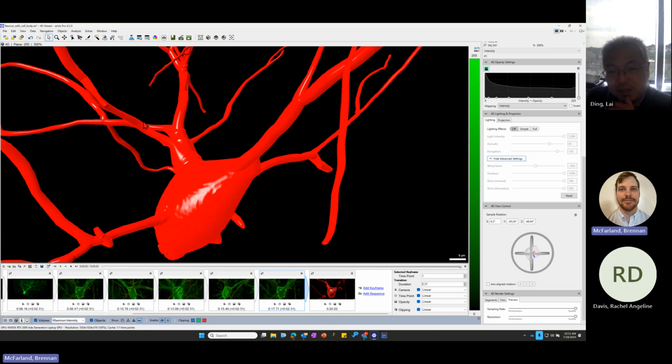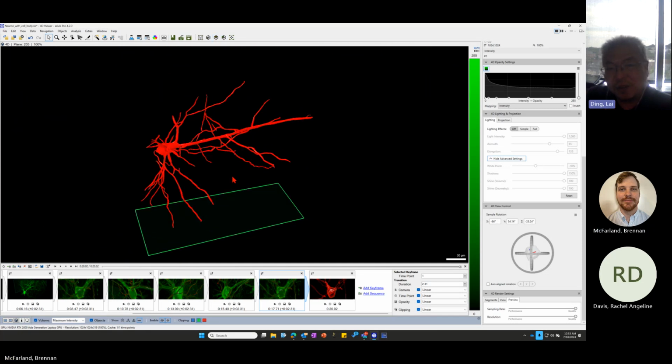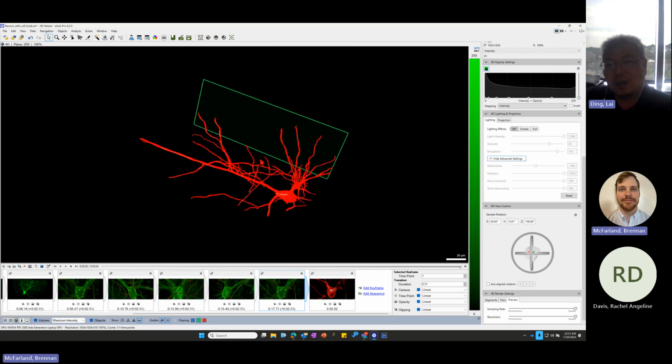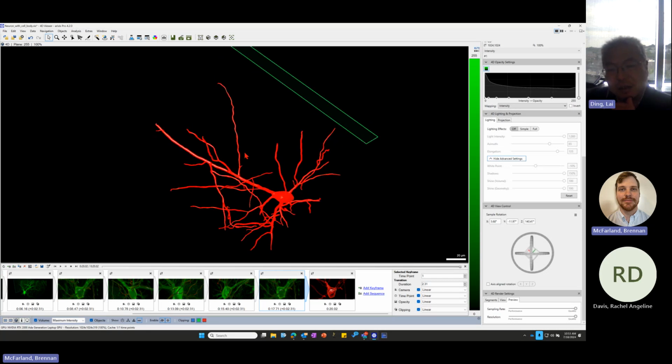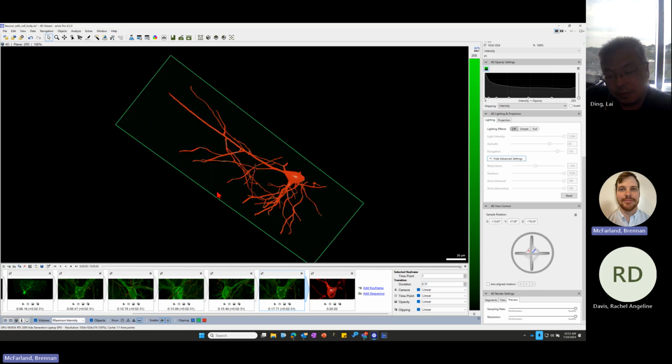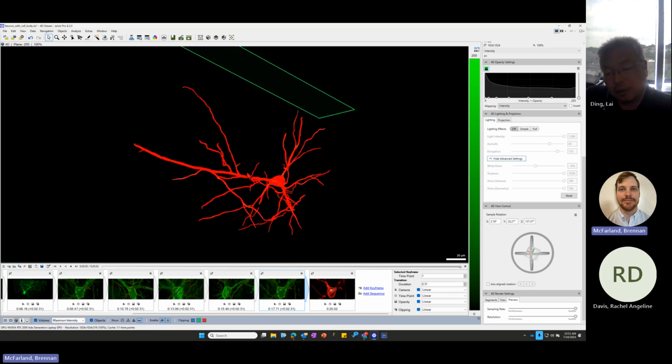It's not going to just record what I do in the software by itself. You would need another app, like Teams, or even built into Windows, they have a screen grab function where you can pick an ROI, and then you can manually do this all yourself and have it screen grab. That's totally fine. In Arivis Pro, it's not going to natively record this ROI. It's only going to record all of those movements if we export it as a movie in here.